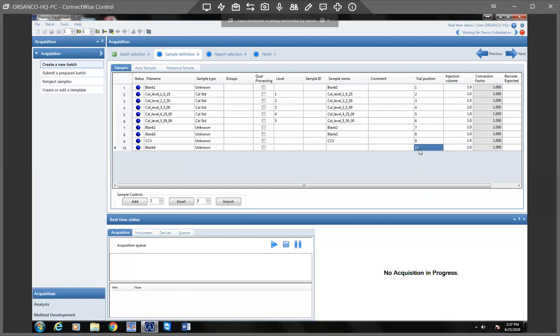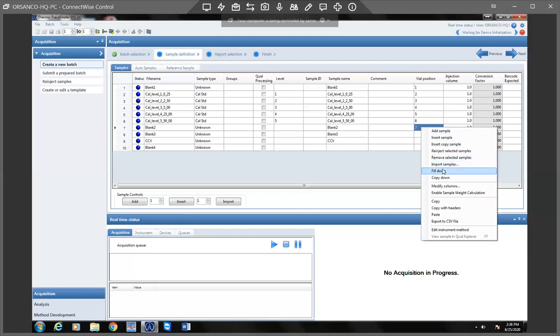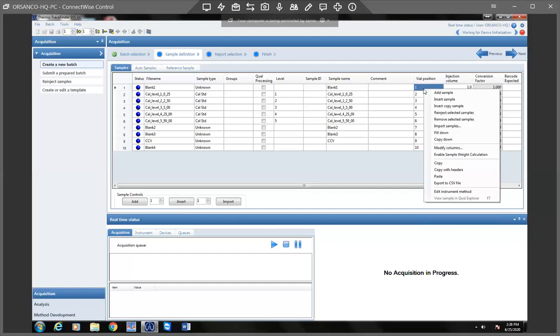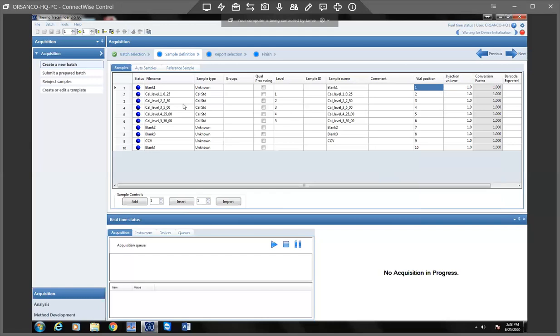I know that didn't look very good because you couldn't tell. Here, I'll just show you because I find it exciting that you can do this. So say we're here and we do fill down, then it'll populate. So it's kind of a neat feature. That way you don't have to waste time filling in file positions. None of those really are too important. So anyway, that is how you would edit that, and you would just go to next.